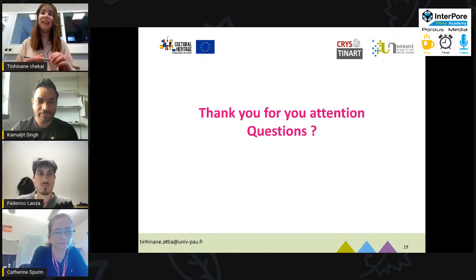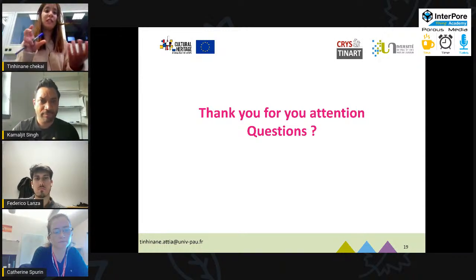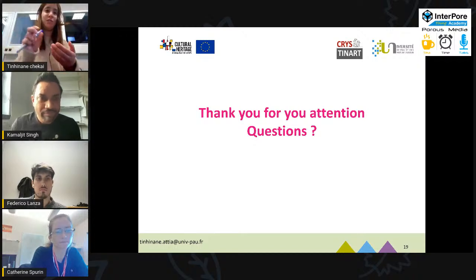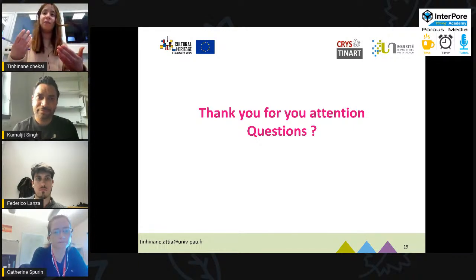Thank you for the question. Actually, in this study, we are more interested in the damage that is caused by the crystallization of the sodium sulfate. And with the technique that I'm using, which is X-ray tomography, we cannot really see the crystal because you should have really high resolution to be able to see the crystal. So we are just interested in how this damage appears, but at the mesoscale.